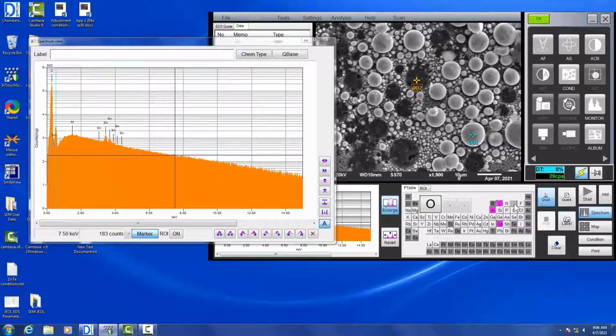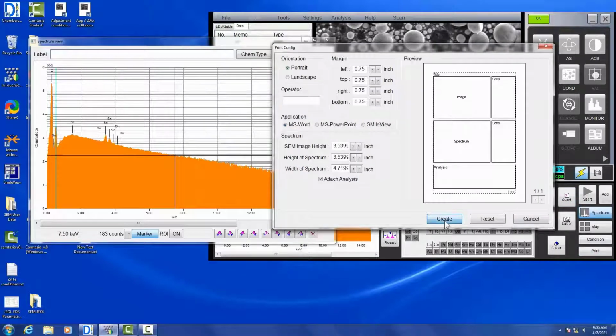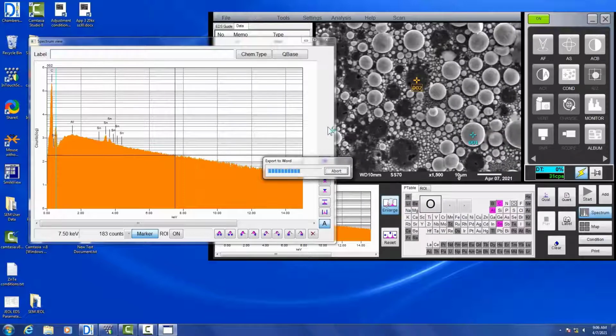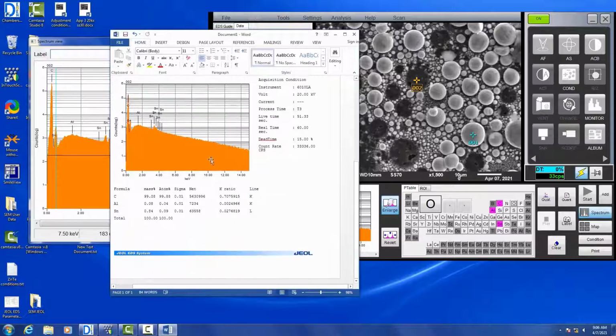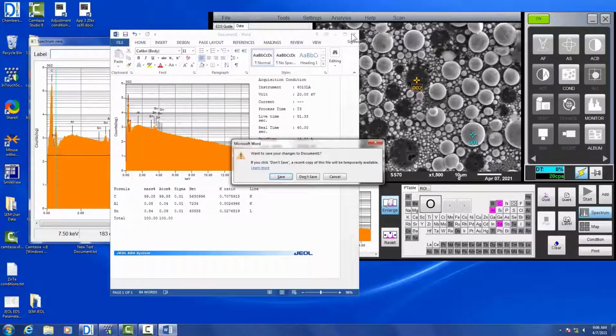All right, so our scans are finished. And again, there could be a slight oxygen peak on there, so it's going to be up to your judgment whether to add that or not. I'm going to go back and take it off and just leave it as is, as the software identified it. So now if we look, we're only getting an image with spot 2 on it.